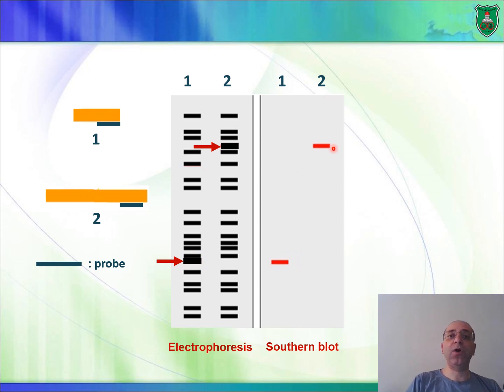That's one. And we know what the sizes of the DNA fragments are because that's how they travel in the gel electrophoresis. Now also pay attention to something that is really important when we present a gel. When we show a gel, we show it in a way whereby the large DNA fragments are shown on top and the small DNA fragments are shown at the bottom. Now notice that the sizes shown on the membrane reflect the sizes of the fragments again, not the probe.